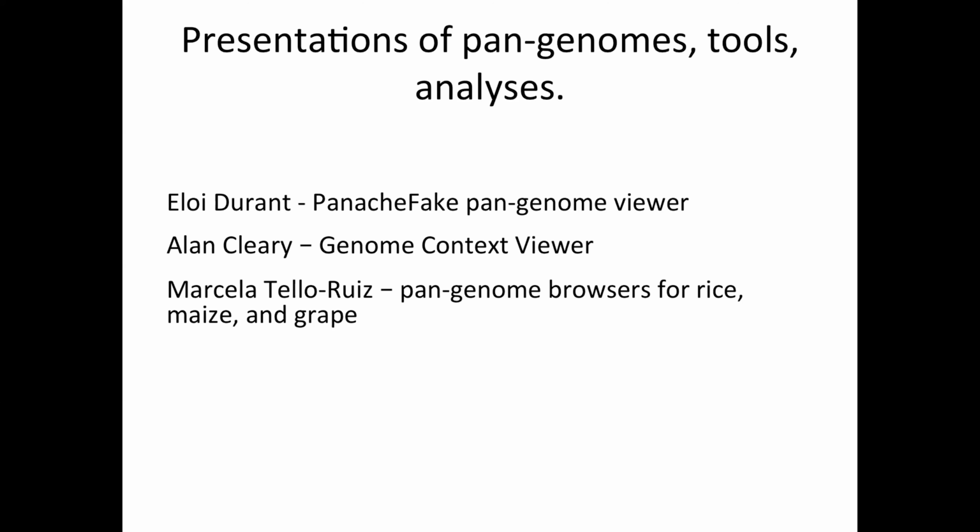So this is the broader question for everyone dealing with the pangenome. Within the species, what thoughts do you have on how some of this data can be used for at least keeping the nomenclature consistent for the set of genes that are conserved throughout? And then how do we accommodate the nomenclature of the genes coming out of new assemblies?